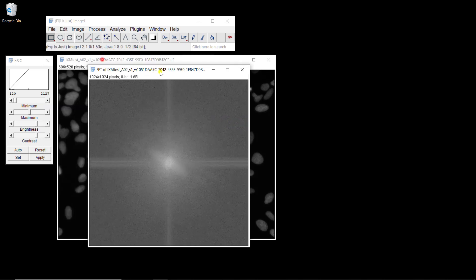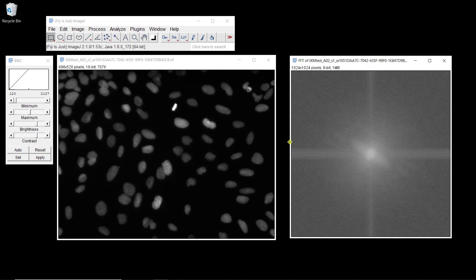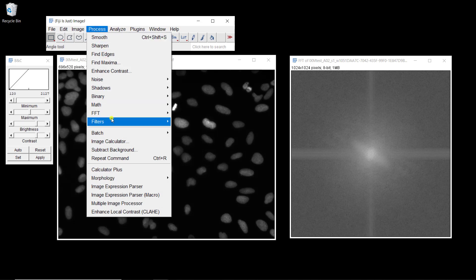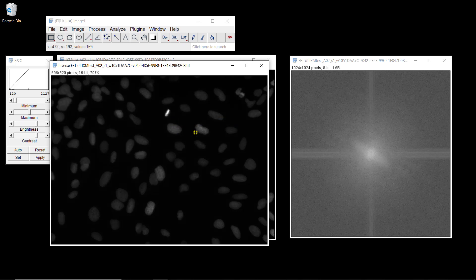Here is the frequential representation of your image. So here you have your image in the spatial domain, and here it's in the frequential domain. The great thing with Fourier transform is that you can apply inverse Fourier transform. Go to Process, FFT, and then Inverse FFT. And you get the inverse of the frequential decomposition — it's the exact same image in that case.